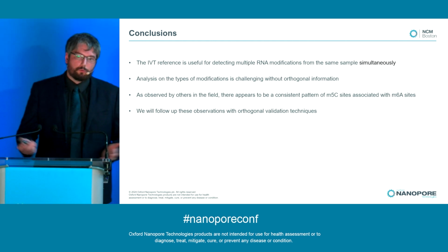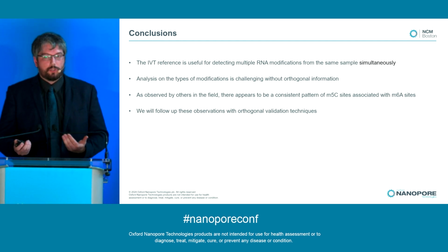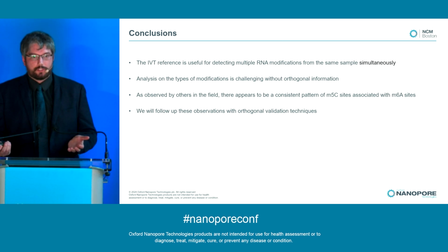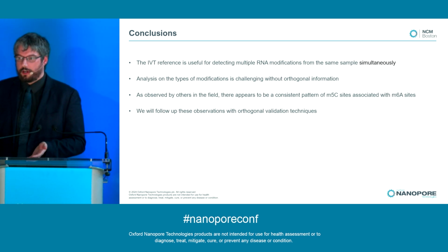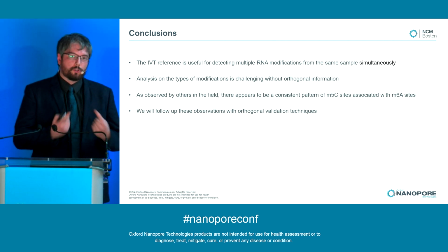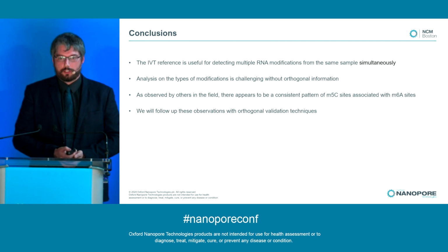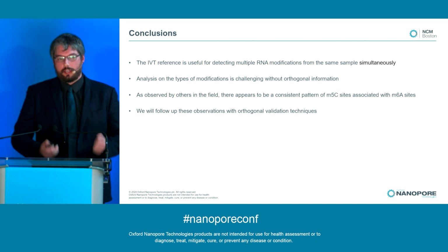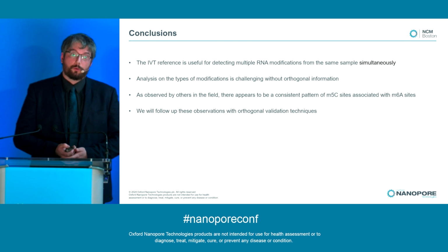And then we're starting to see in the last 2 years, there have been more and more publications coming out showing that there is more M5C in mRNA than previously thought. And with 2 papers that I've seen recently are showing that there is some coordination between these modifications, and they do have a biological effect. And we are planning to follow up these with experimental validation, and we're trying to get the preprint out quickly.